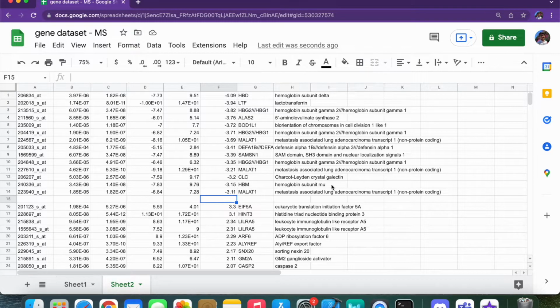But now we want to get into the prediction of it, right? Our fundamental objective in this project is to be able to predict early onset of multiple sclerosis and not just identify a few key genes. So how exactly do we do this? Let's get into it. Okay, so let's take a step back and recap exactly what we've done and what we want to do.